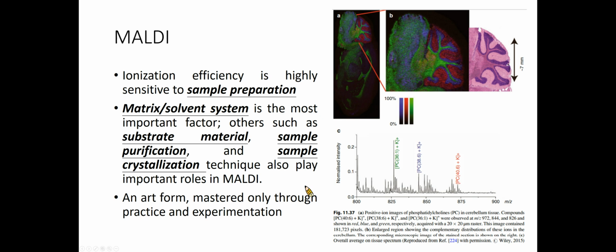In addition, MALDI imaging can be an art form that visualizes the distribution of chemicals or metabolites in tissues or biological samples, which provides invaluable spatial information.